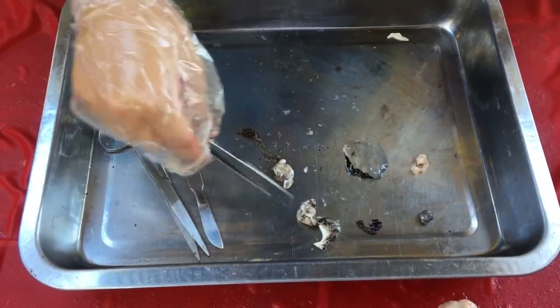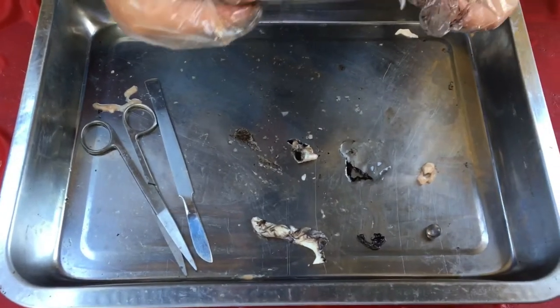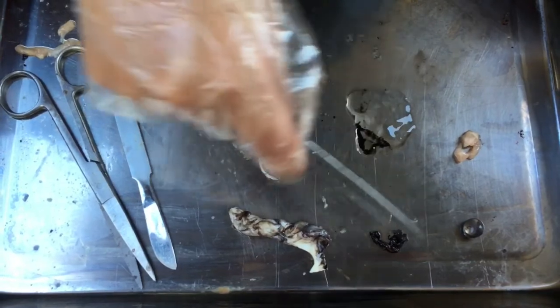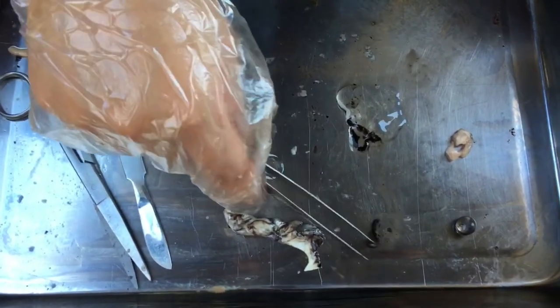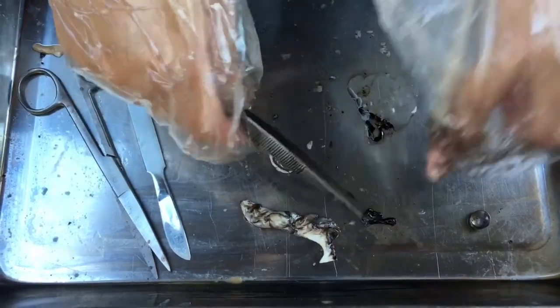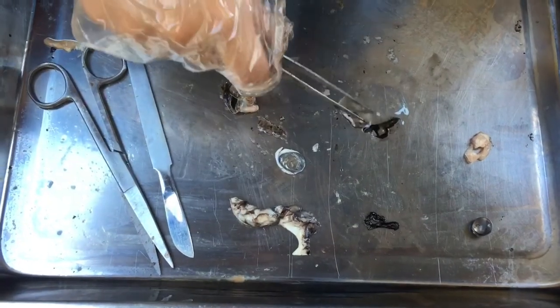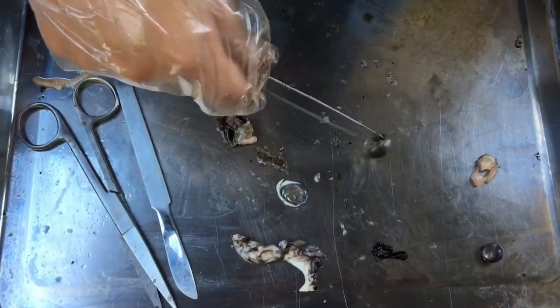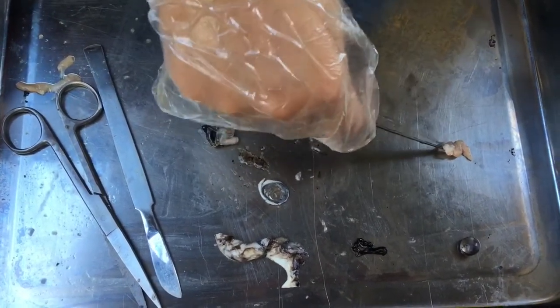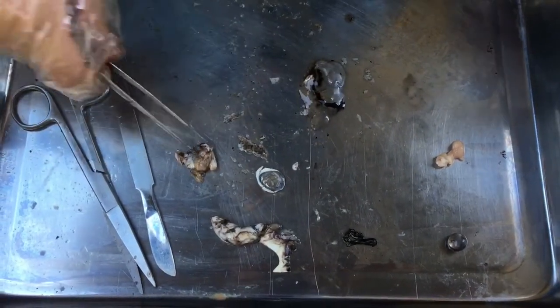These are some of the parts of the eyeball. This one here is the lens. The retina is attached to the iris, the sclera, and then here is the vitreous humor, and here is the extraocular muscle, and then the optic nerve.